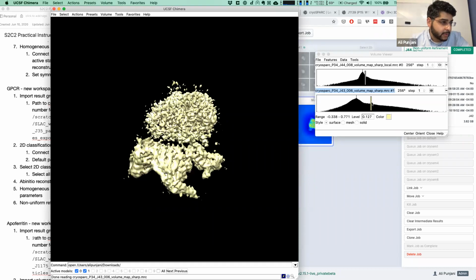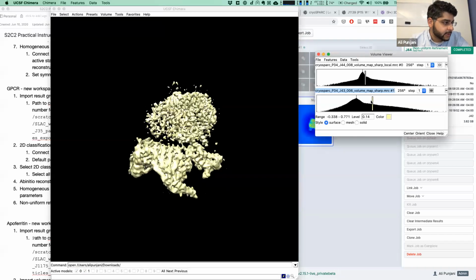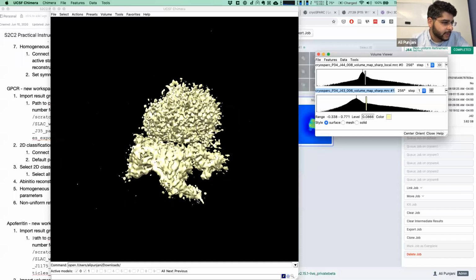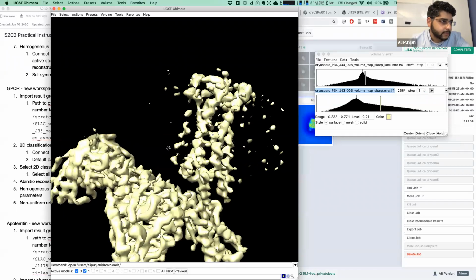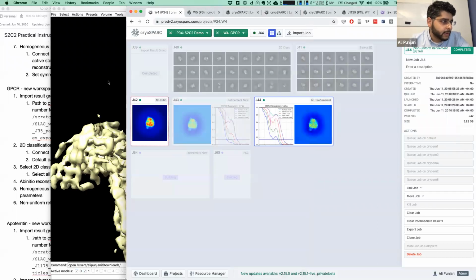And that's exactly what the problem ends up being, that not only in the micelle, but in various other areas of the protein, you can see also all kinds of excess density that really shouldn't be there at lower thresholds. Parts of the structure are being misregularized. So that's a standard refinement, and that's what our transmembrane helices look like here. Right there, yeah, 43 and 44.